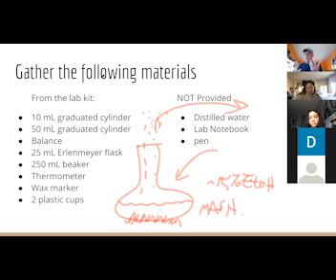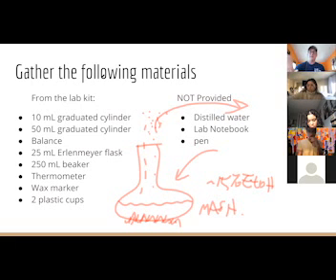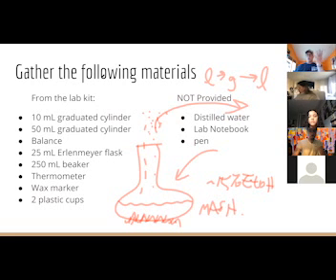Bingo. Excellent. Yeah, that's all that means. Basically, I'm taking my ethanol, I'm boiling it. I'm turning the liquid into a gas. Now that I've got a gas, I need to turn it back into a liquid again. So I'm going from liquid to gas, back to liquid. That's distillation. And so when I'm boiling this, how come the water doesn't boil too?